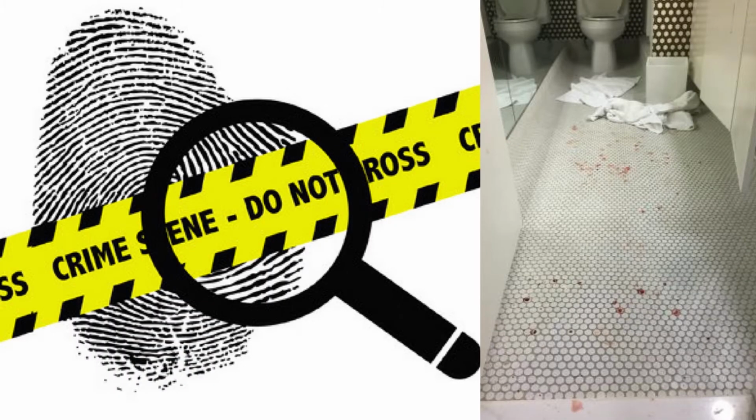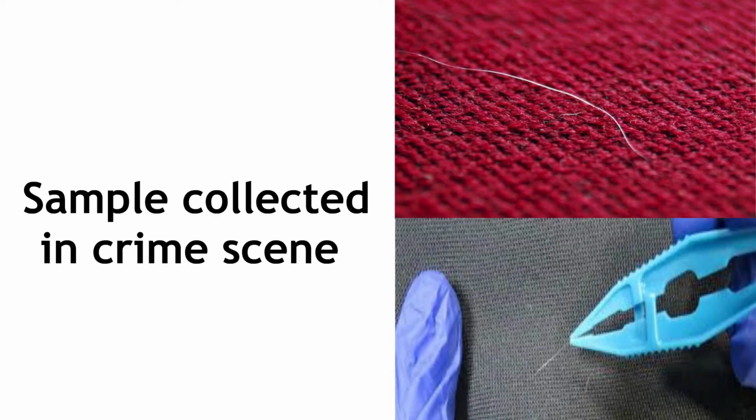Hello, I will be talking about the introduction. The teenager was found dead, lying on the tile floor of the toilet in the house. The victim was strangled to death by the killer. Two unknown threads of fiber were found on the victim, which are suspected to link to the killer. Based on the threads found, we are going to check the fiber analysis.